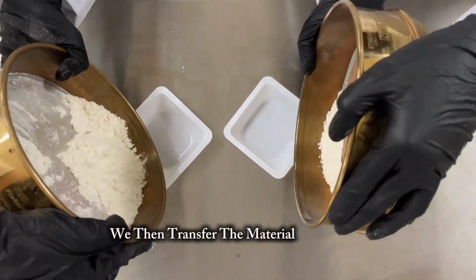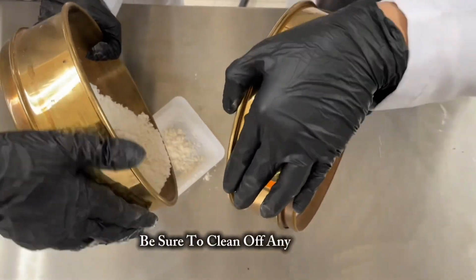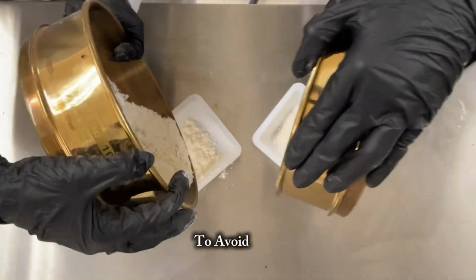We then transfer the material retained on each sieve into separate containers. Be sure to clean off any particles sticking to the mesh to avoid losses.